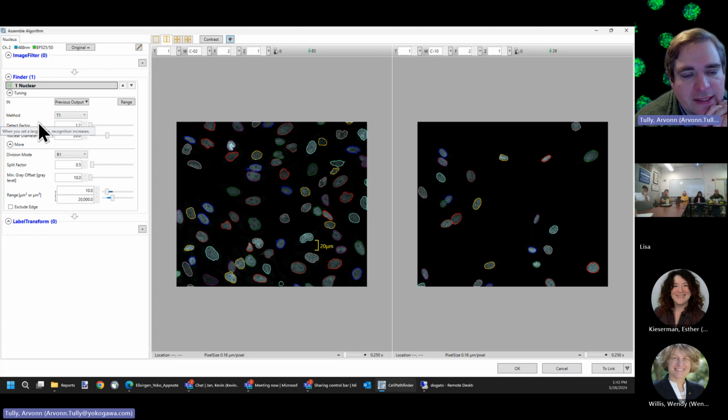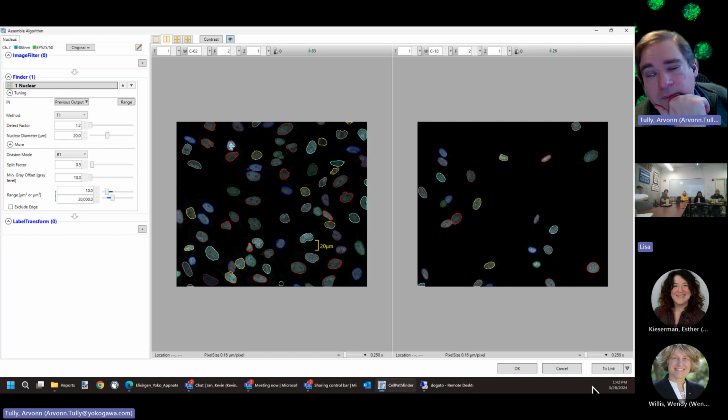What it's doing is there's some unitless value which is multiplying the number based on, I don't even know, honestly. If we switch to the advanced, which I'll do later, I'll give you a little bit more visibility, but it's some multiplicative factor which brings up the background.